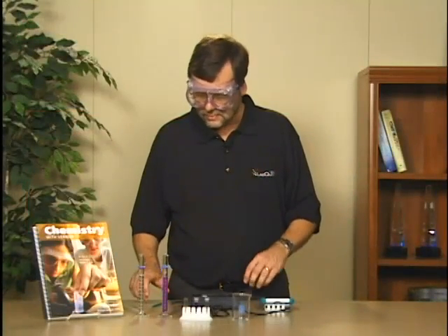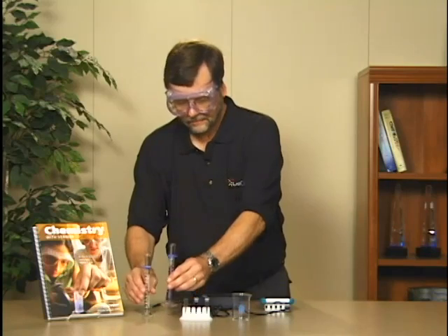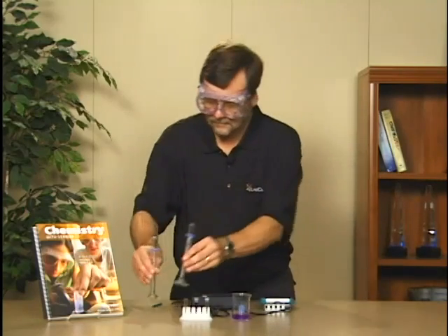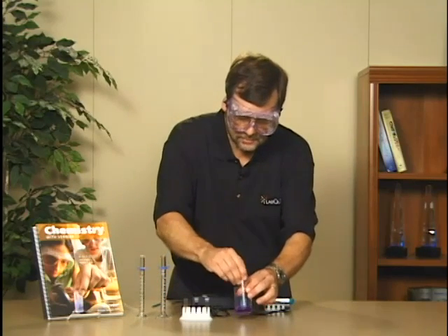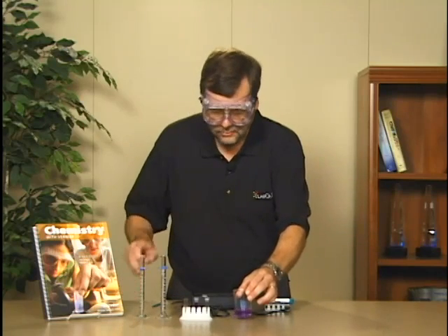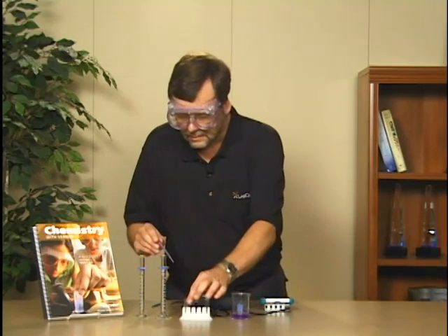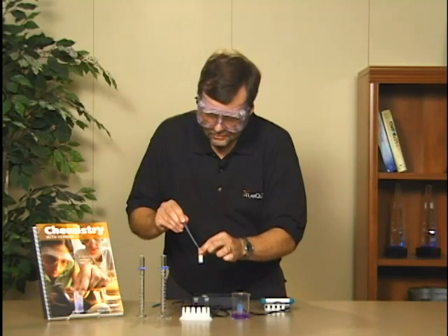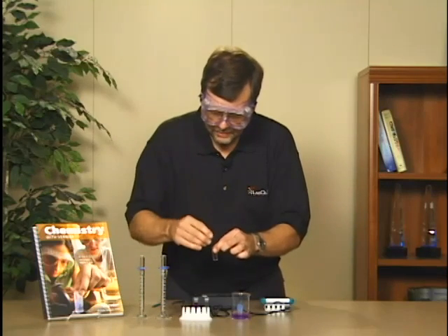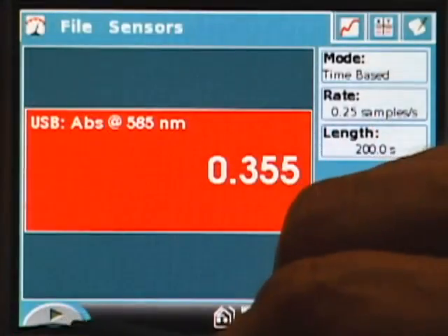Next I'm going to start the reaction between crystal violet and sodium hydroxide. I've got 10 mLs of both solutions and I pour them alternately into a 100 mL beaker, then stir to make sure the mixture is homogeneous. I draw some of that solution into a barrel pipette to make the transfer easier, transfer the reaction mixture into an empty cuvette, place a lid on the cuvette, and put the cuvette into the cuvette slot. We're now going to begin data collection.